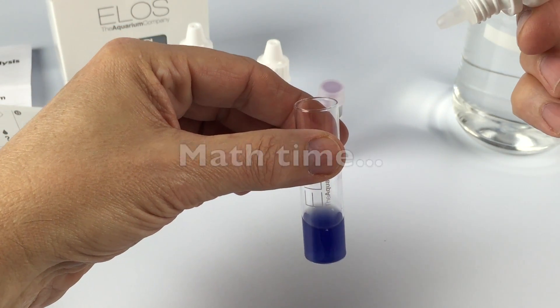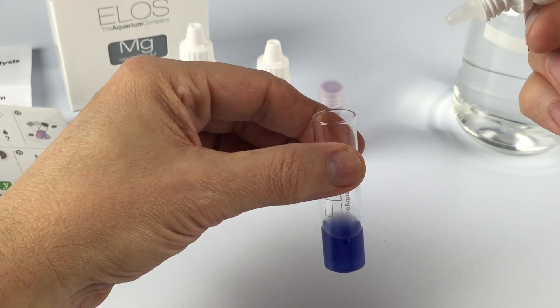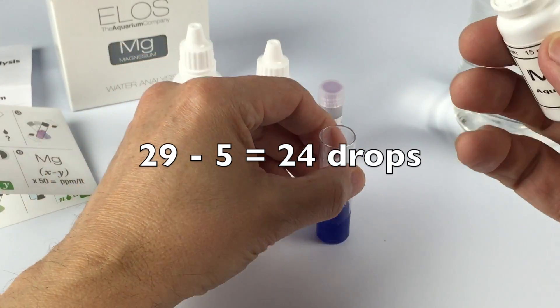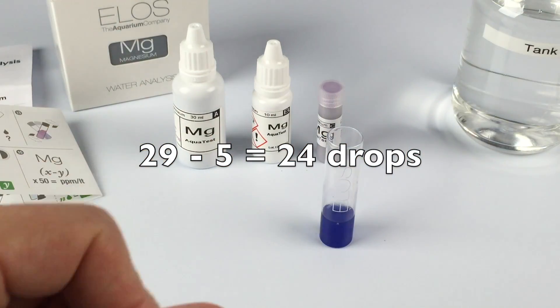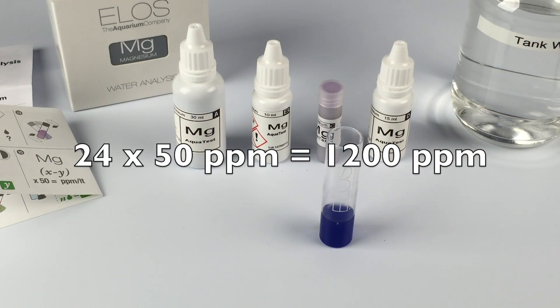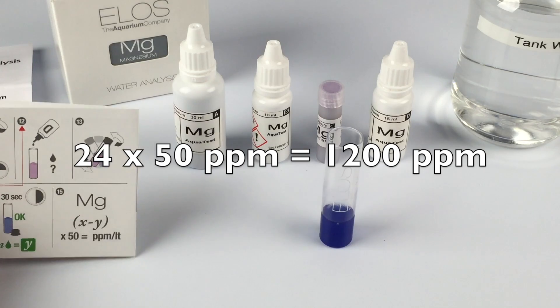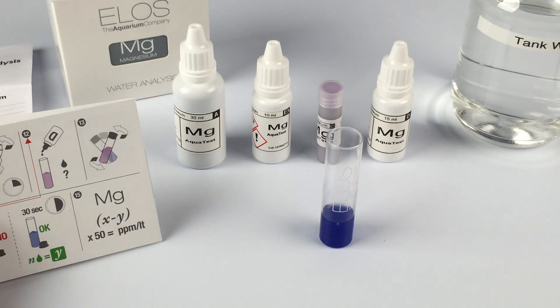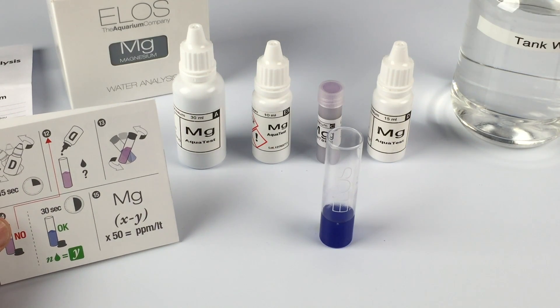Remembering the first part of this test, I had 29 drops and I just had five. I'm going to take 29 minus five, which leaves me with 24. Then I take 24 times 50 ppm, which means I have 1200 ppm magnesium in my tank at this time. My reef is deficient in magnesium and I need to dose more.